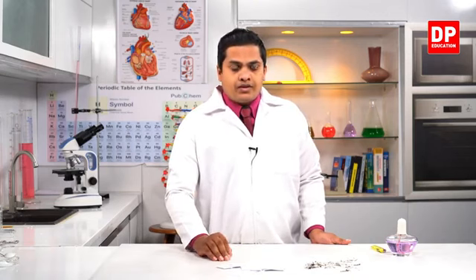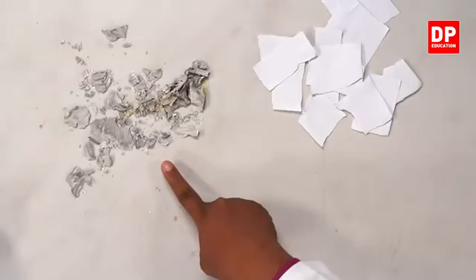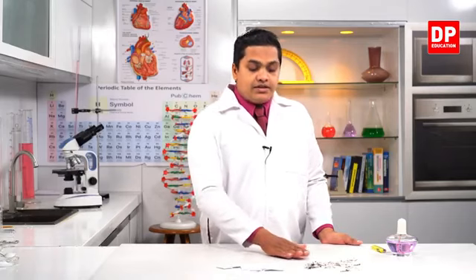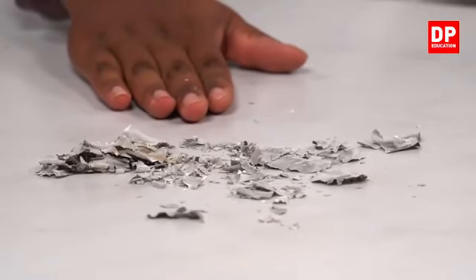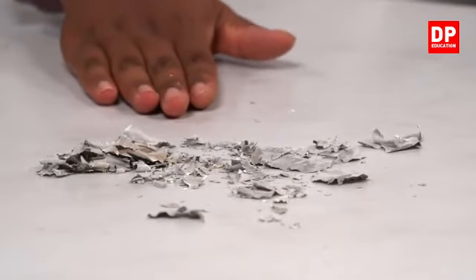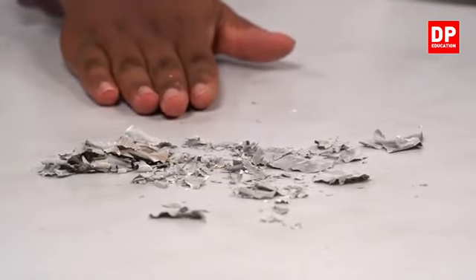Right? The second half. This half has been destroyed completely due to fire. This means that this is not paper now. The paper has changed into a different kind of substance.